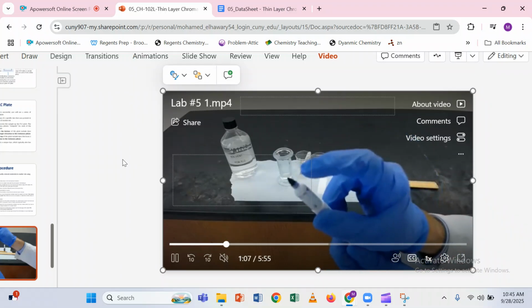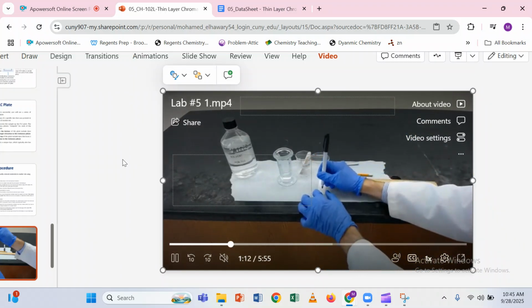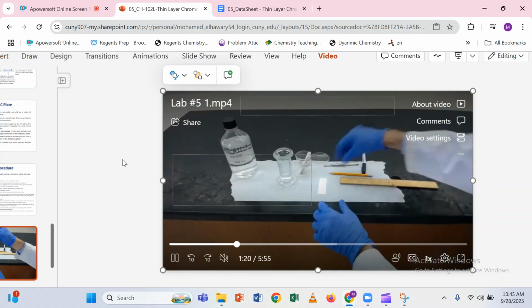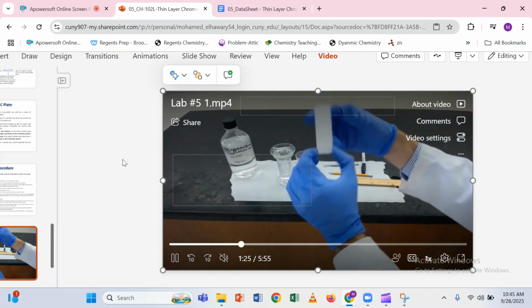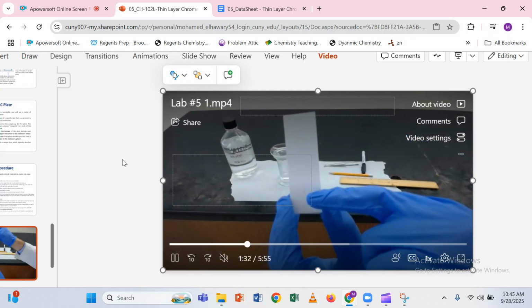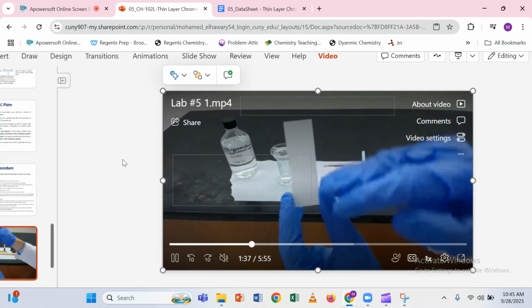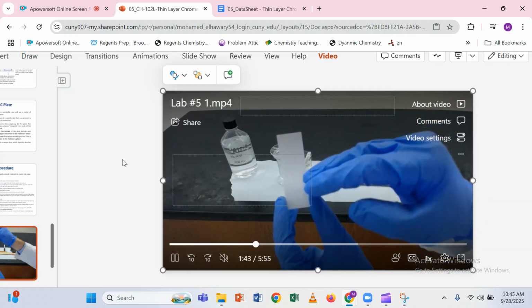So it's very important to have this initial location. Now here is our mixture, the dye. So notice we're going to take this dye in our marker, just a regular marker, and we're going to place a small dot at the center of our line. Now we should be using forceps, and that's one experimental error, but we're using our hands for this experiment. Again, a little dot, very tiny. We're not going to make a big dot, and you'll see why in just a second. That should give us the best separation.